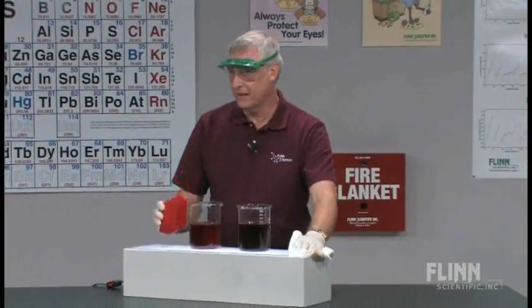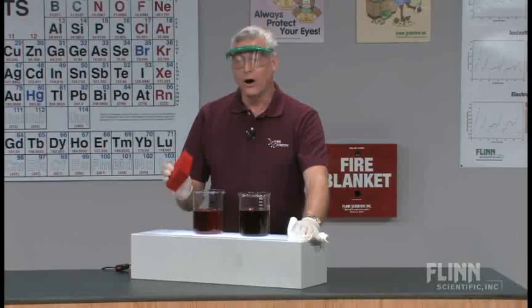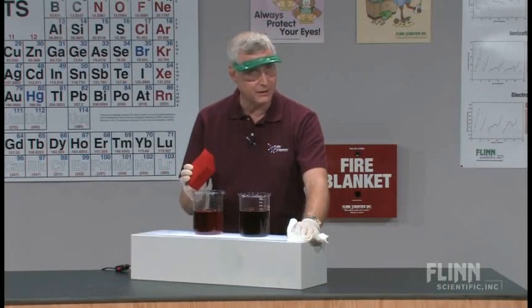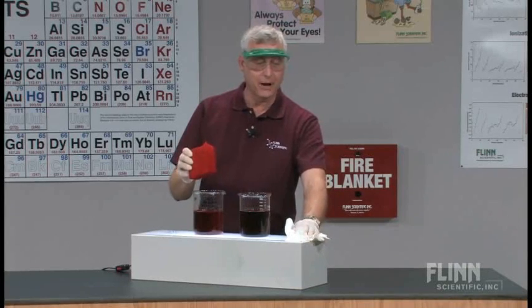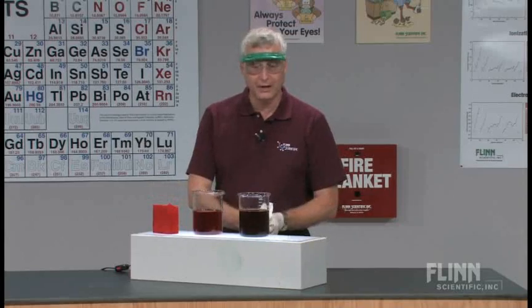And so if you play this right, because all of us have had demonstrations that didn't demonstrate the way we thought they would, they're often useful. If you play that up, say, ooh, I'm not so sure what was happening here, you can play that discrepant event along, and you can get the students to look and think about what's happening. This is a nice demonstration, and it will work a couple of different ways.